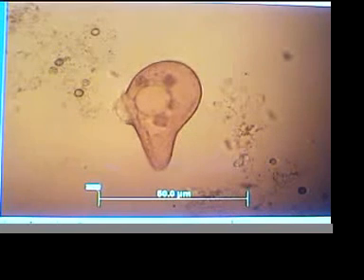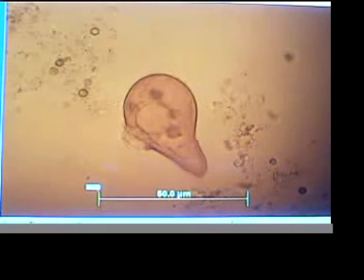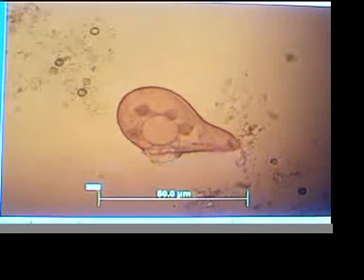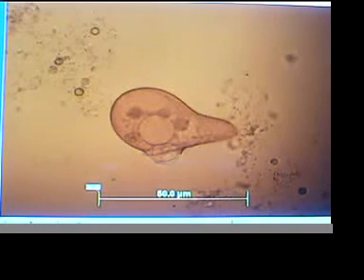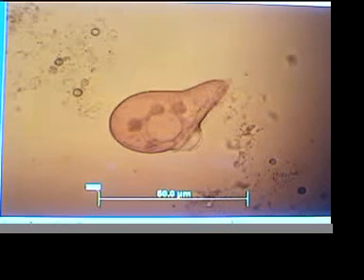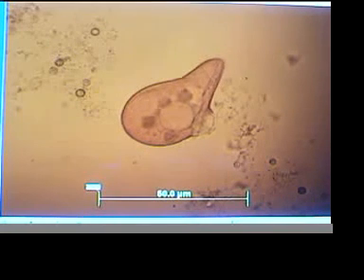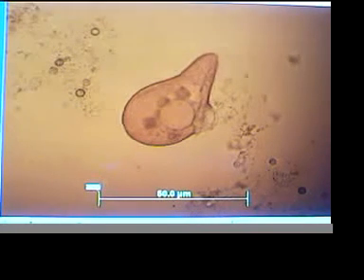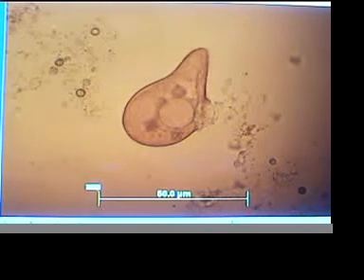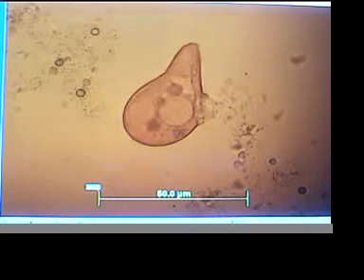But I'm only using a 100 watt phanotron bulb, and it's about 5 inches from the slide where this organism is located. There are no wires leading from the bulb to the slide, and no metal plates behind or under the microscope. Just a normal microscope with a light bulb next to it. And we'll pause the camera.